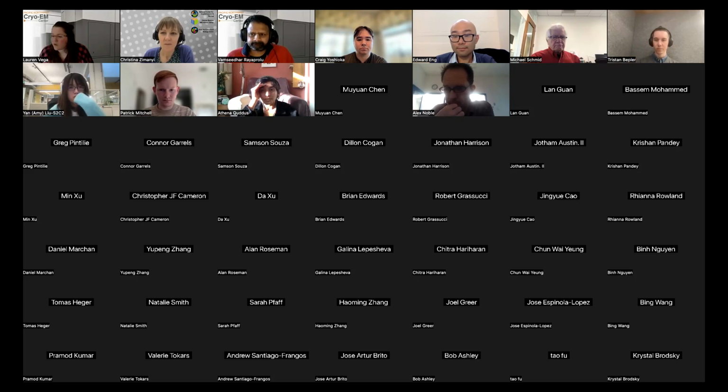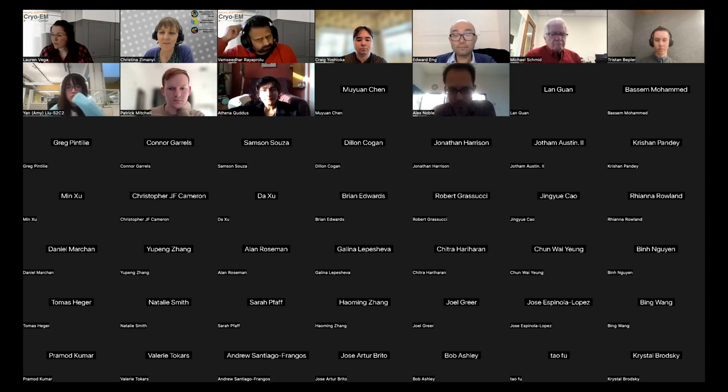There's a specific question in the chat regarding the EMAN2 neural network training. They're wondering, if the feature you're looking for is small, is it more advantageous to decrease the box size around it or to just optimize your manual annotation, or both? Oh, yes, I missed that one. As long as it's bigger than say 4 pixels or something, it should be fine. But reducing box size shouldn't hurt that much either.